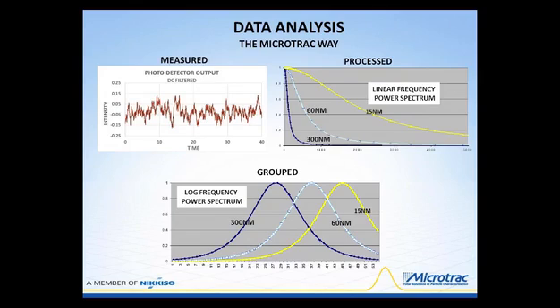When we mix it then with the reference beam, you have a base intensity, which is the DC part, but you also have an AC part, which is the Doppler shift that was imparted on that scattering event.